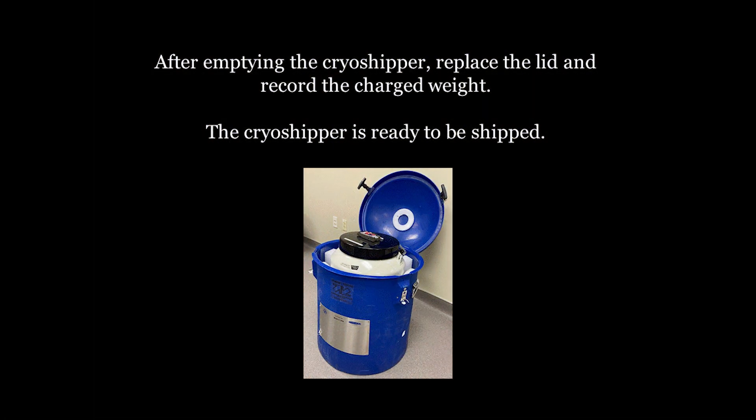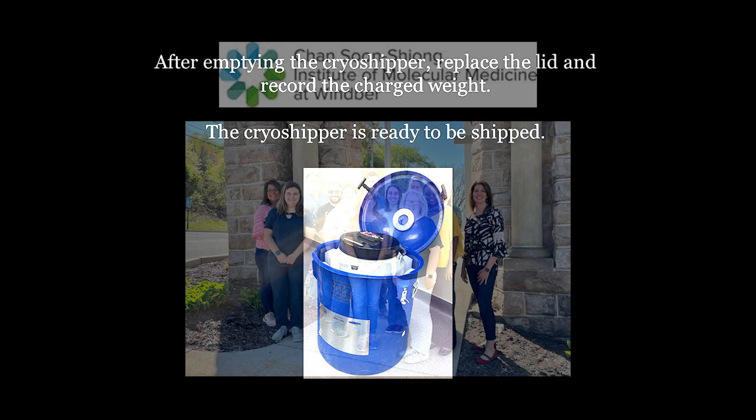Replace the cryoshipper lid and obtain the charged cryoshipper weight. Place the cryogenic dewar in a secure location free from traffic until all liquid nitrogen evaporates. The cryoshipper is now ready to be shipped and should have a static hold time of 14 days. The static hold time will vary depending on the model of cryoshipper.